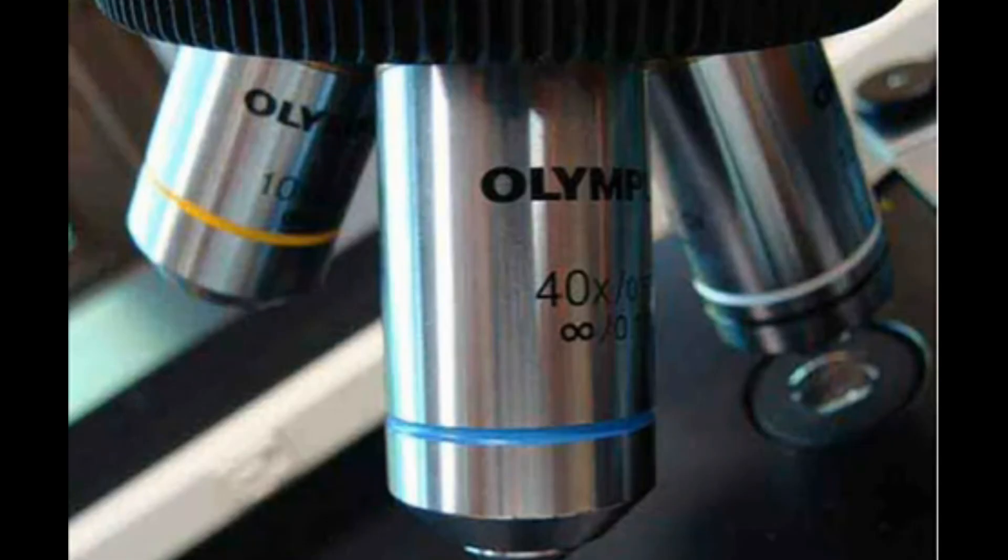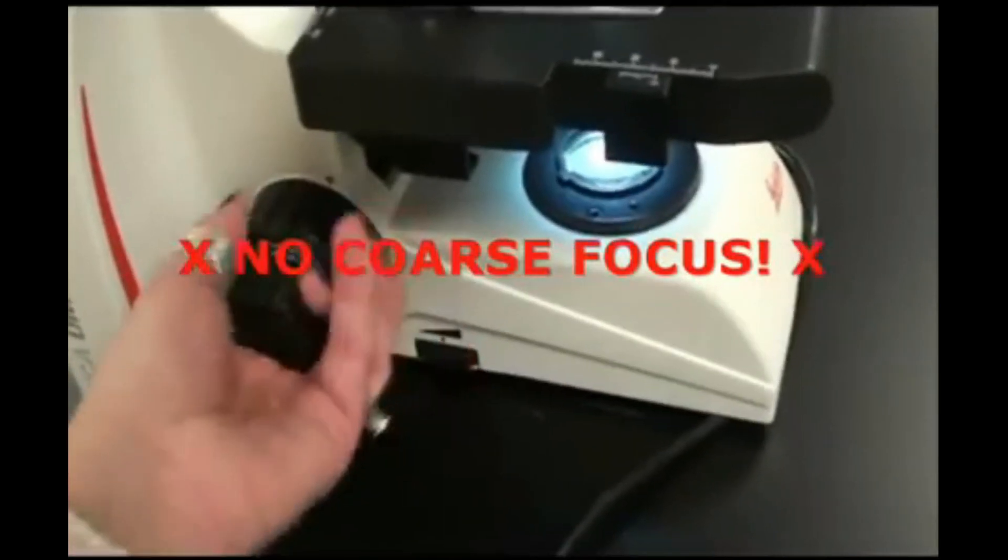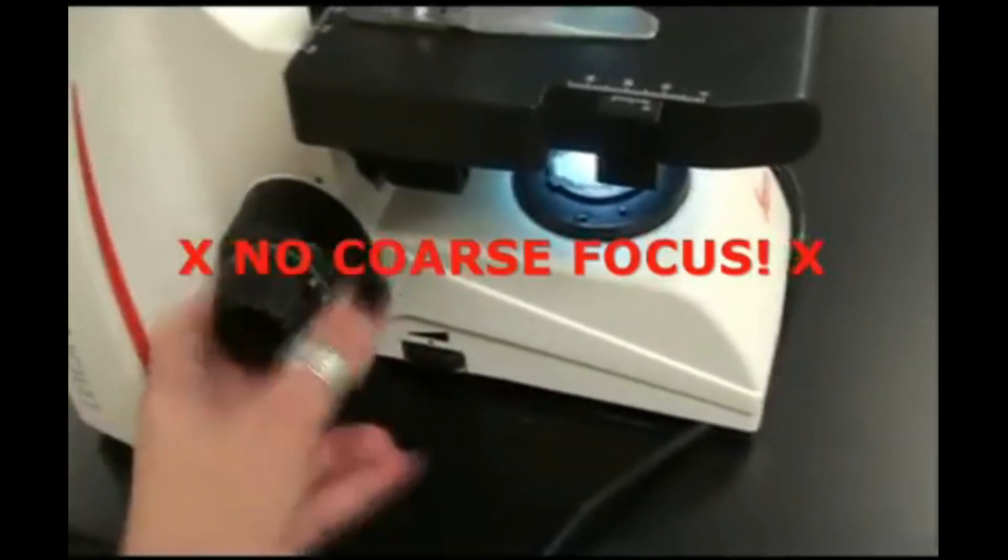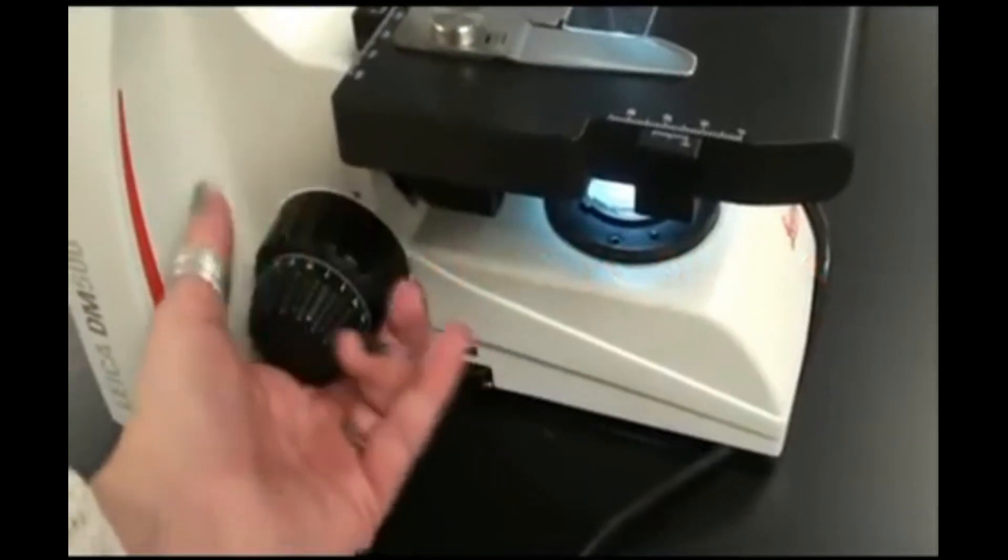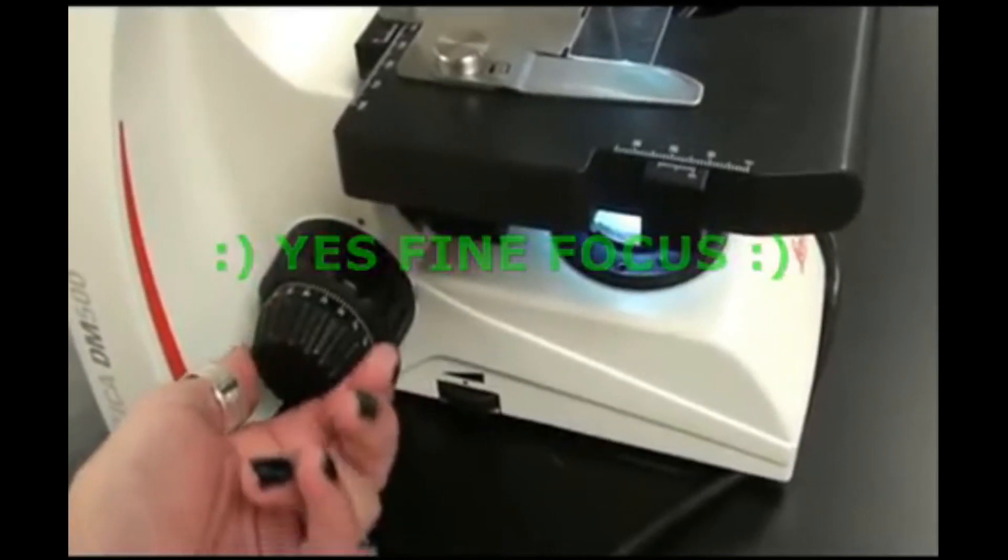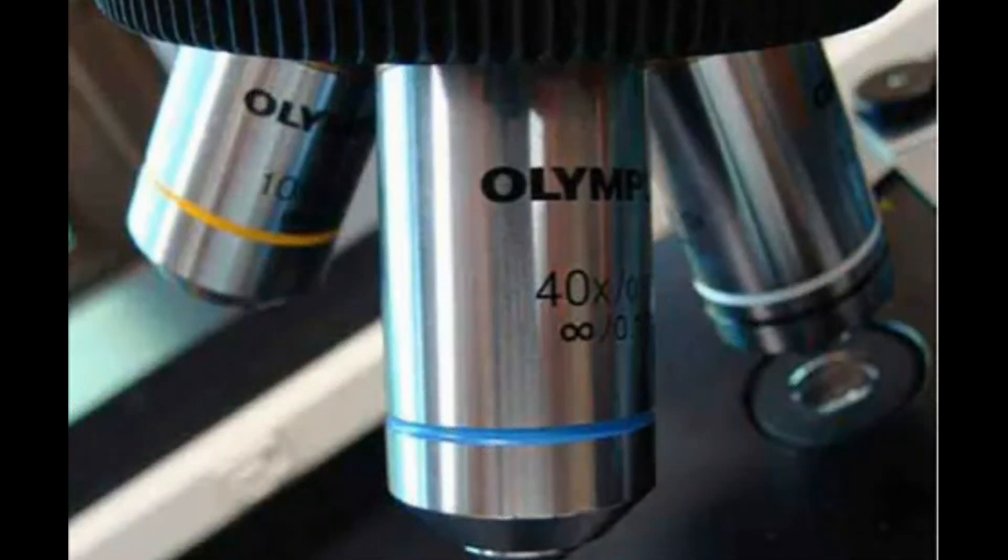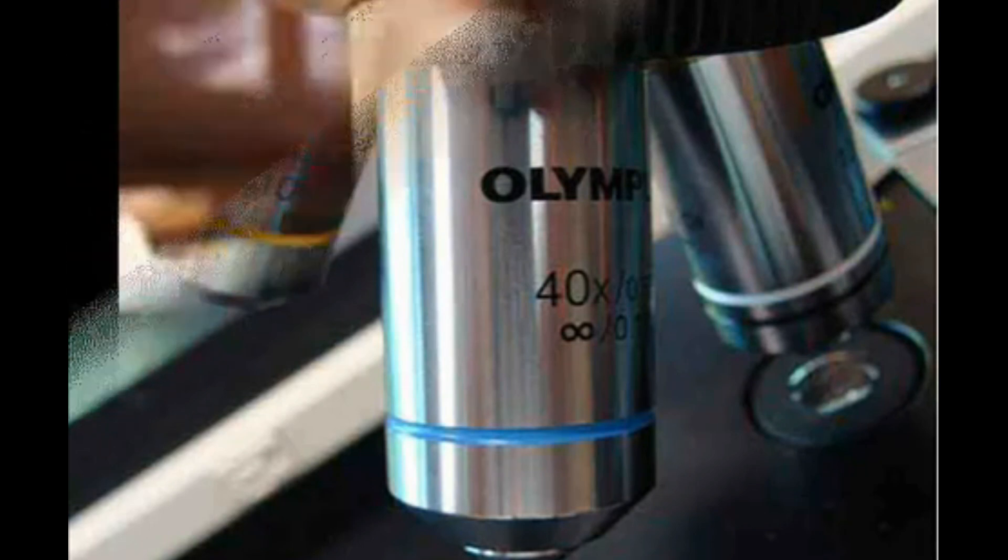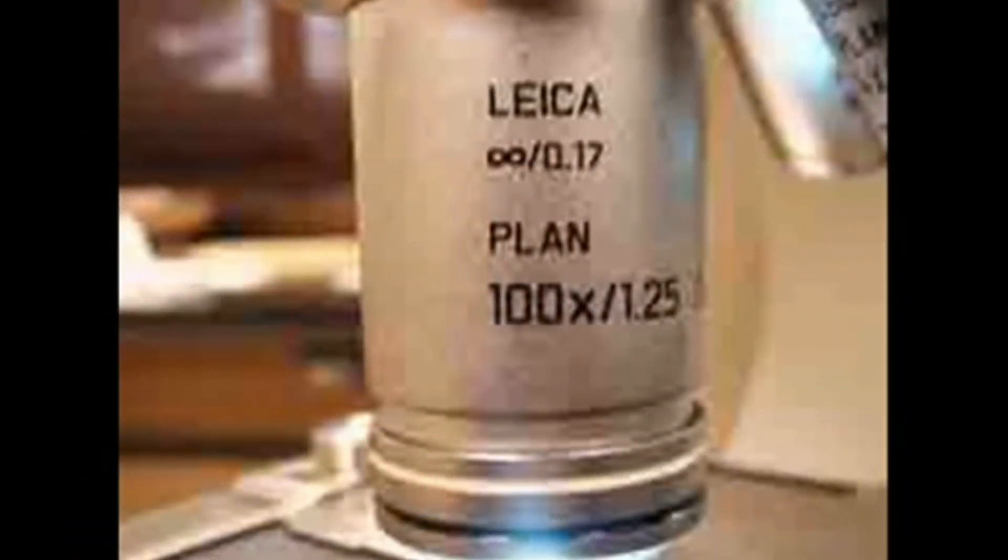An important warning. Whenever you are using your high dry objective or your oil immersion objective, these are your two longest lenses. Never adjust the coarse focus. When you are using these longer lenses, you are only allowed to use the fine focus, again, that knob that is set within the coarse focus knob. Manipulating the coarse focus when using these longer objective lenses will at the very least take your specimen out of focus immediately, and worst case scenario, could smash the lens into the slide, damaging the microscope.